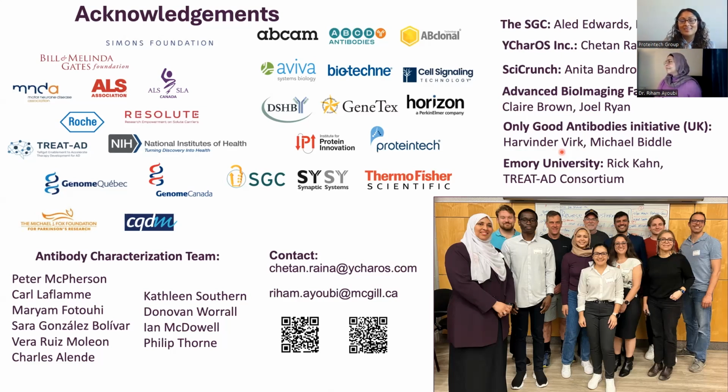Thank you, Afrida. We do have a few questions for you. The first question is asking, an issue I often encounter during Western blot is the presence of numerous non-specific bands that are not mentioned on the supplier's website. Do you have any advice on how to avoid these non-specific bands, which can be problematic when analyzing Western blot? And they are specifically using the cell line MDA MB231.